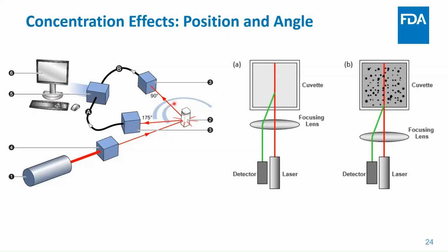And also here, we have a laser attenuator, which changes the amount of laser power going into the system. And that's another thing that often is used. It's either automatic. A lot of people just leave the setting on automatic, which basically decreases the laser power going into the system. And this is usually a function of concentration.